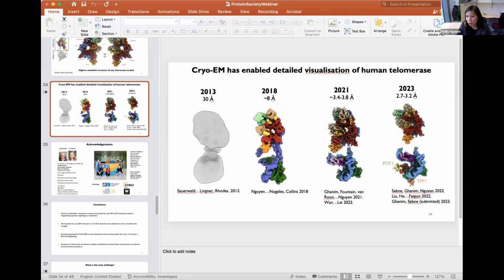And do you see it still continuing? How far can we go? Currently, for this last one, we're not using the best of the best, but we just bought that setup here and it's being installed. So I'm very excited to try out even the latest technology that people are using to get down to 1.2 angstrom.